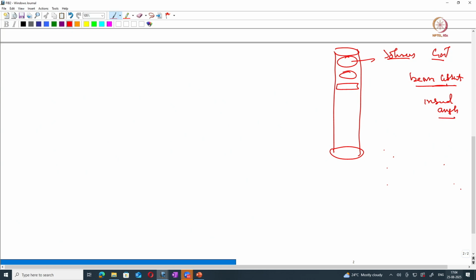Here you have an objective lens, which focuses the beam, and you have a set of lenses, octopole or quadrupole, which control the scanning of the beam and also the aberrations of the beam. And you have blanking plates.